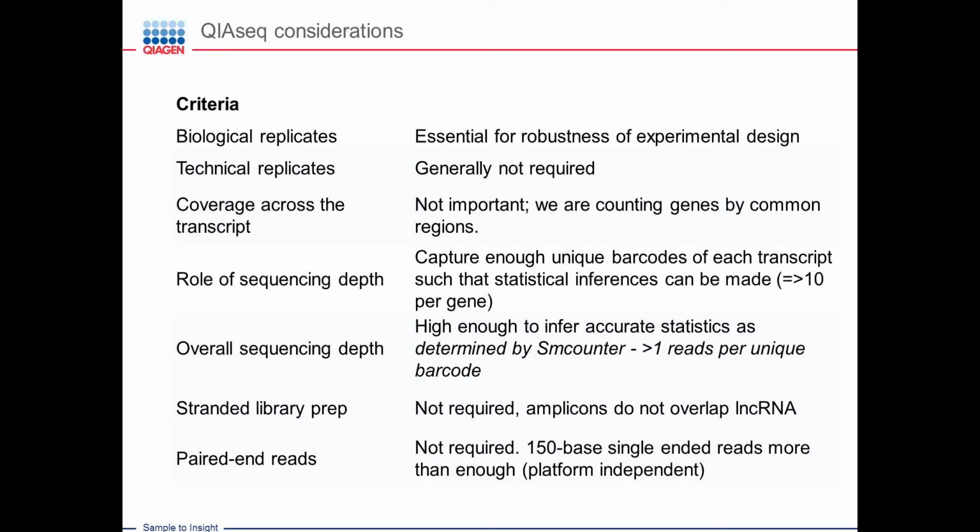So all of our amplicons are very constrained in size and TM and in PCR efficiency, so that we do extremely uniform multiplex PCR. So that works really well for us. But we generally cover all variants that are in the Ensembl database.